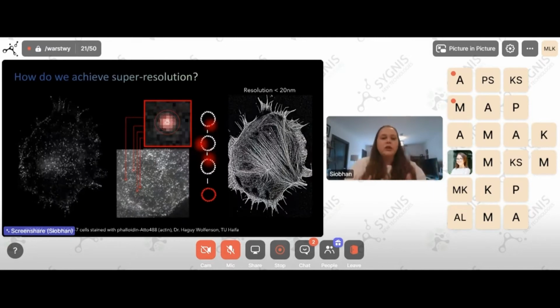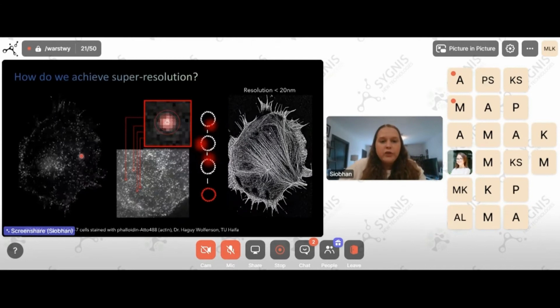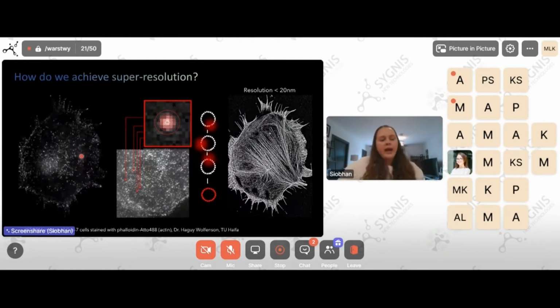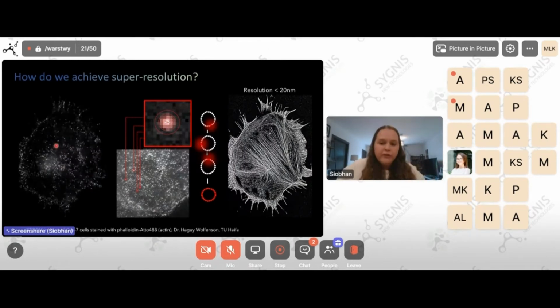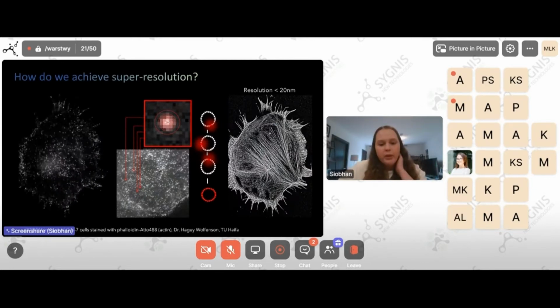So essentially you'll excite that fluorophore to start blinking. You should actually be able to see this in the video on the left-hand side. This is just an example where the actin network has been labeled with phalloidin conjugated to ATTO488, and ATTO488 is one of these dSTORM compatible dyes. When we have this sample in a dSTORM buffer, you're exciting the fluorophores to go to a fluorescent on state and to a fluorescent dark state. And this is the behavior that we call blinking.